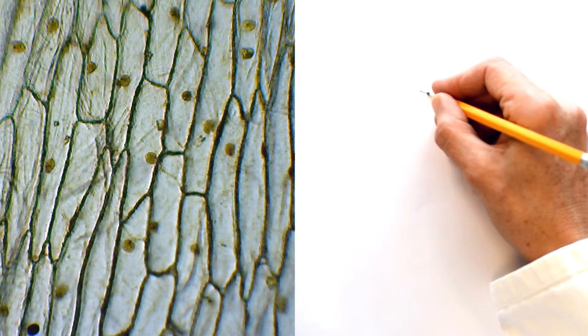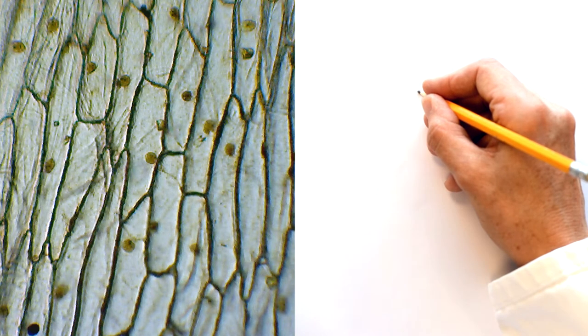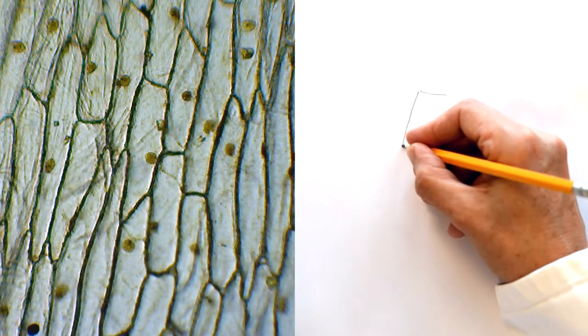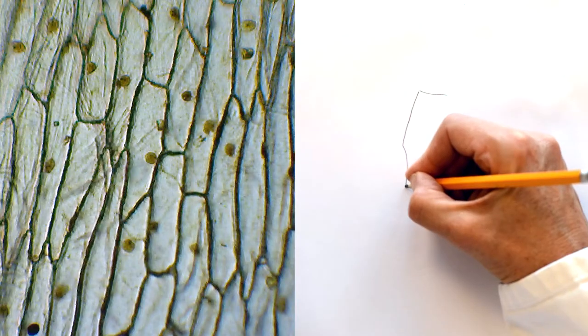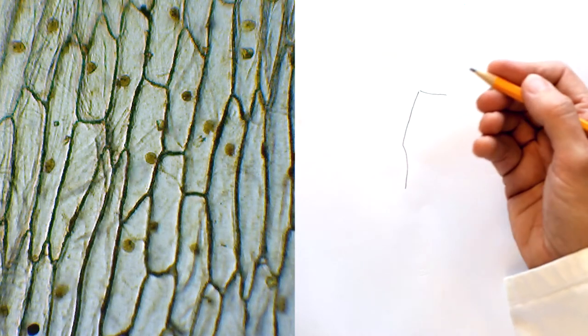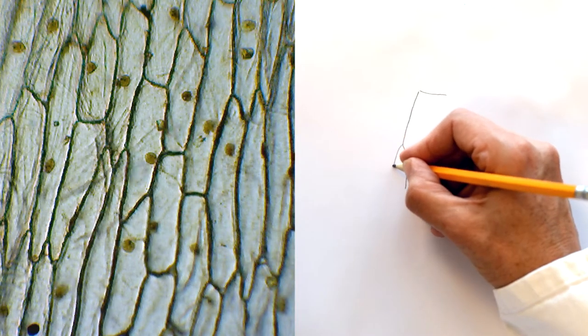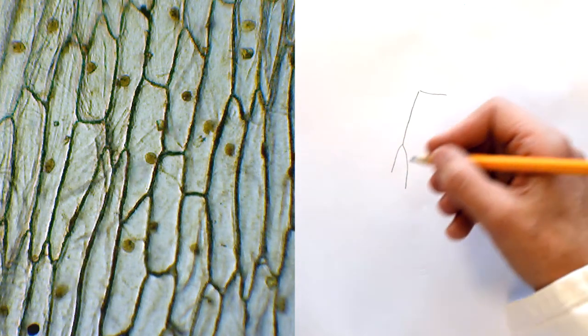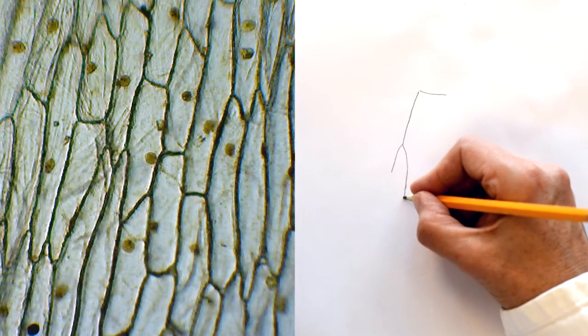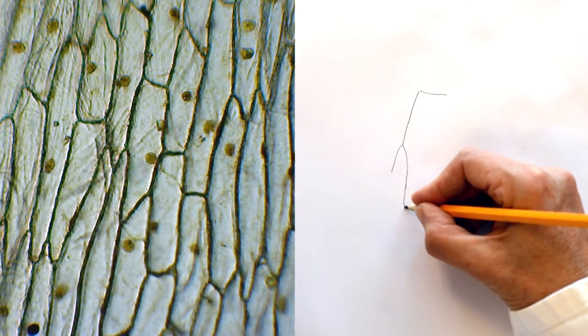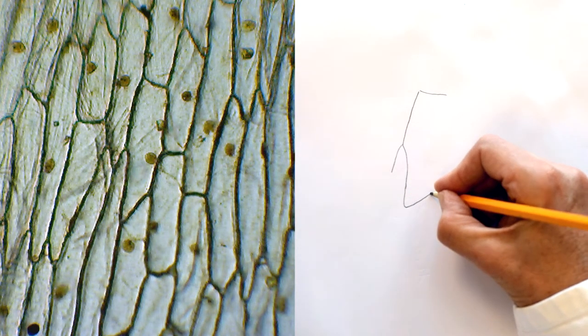So the first cell that I'm going to draw is roughly an oblong cell but I do notice that it's got a second cell interacting with it from one side so I need to put that interaction on and to make sure that I don't forget that interaction I'm going to draw that interaction in now as well. So now I need to think how long do I need to do this line and now I've got the side of the cell.